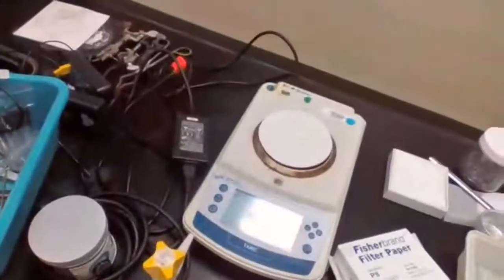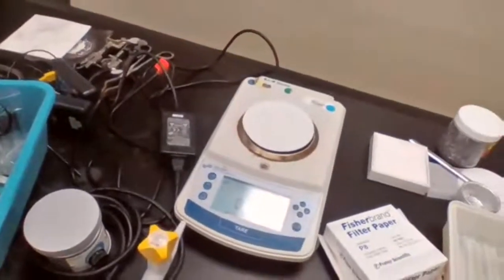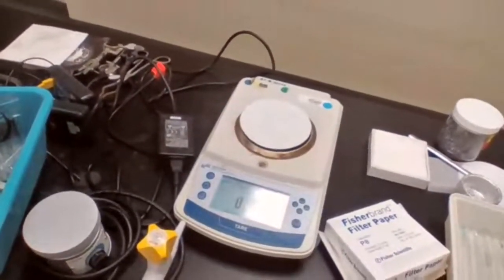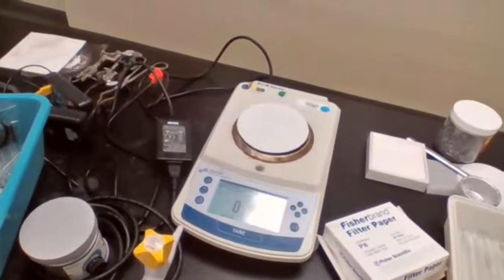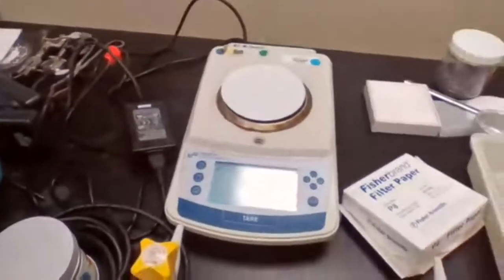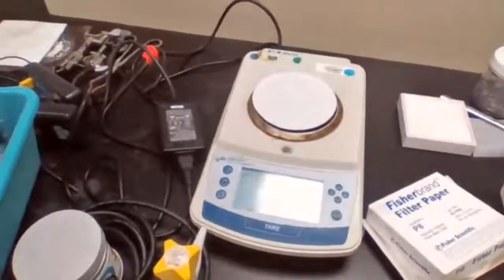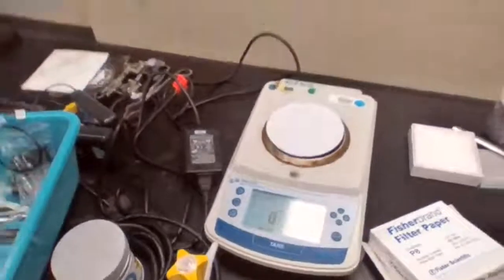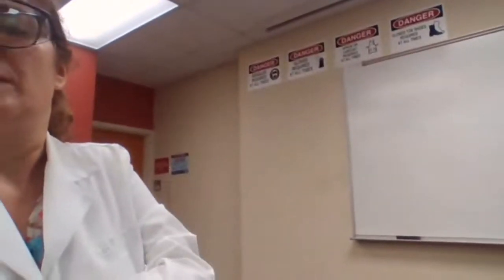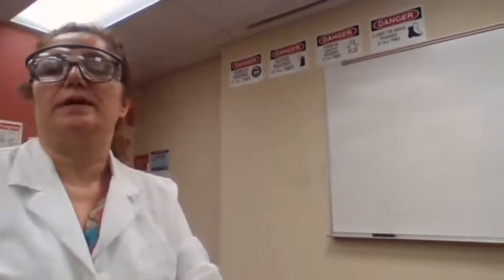Okay. If you want to take a screenshot, you can. 0.946. Good. 0.946. If you cannot see, just write that number then, please. Yes, 0.946.